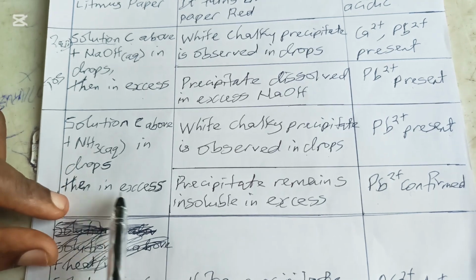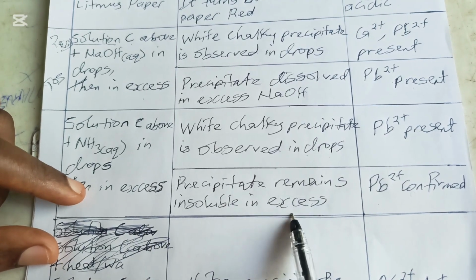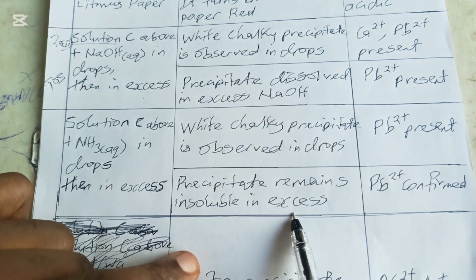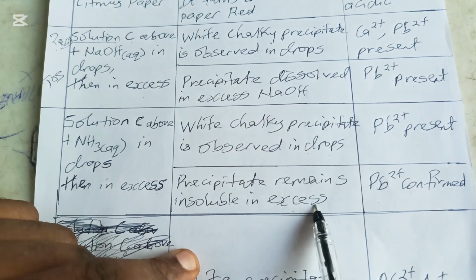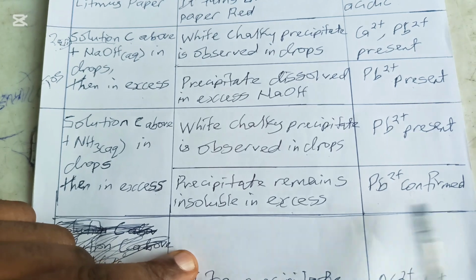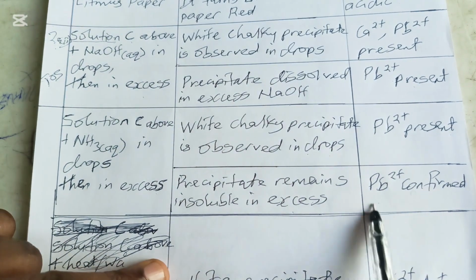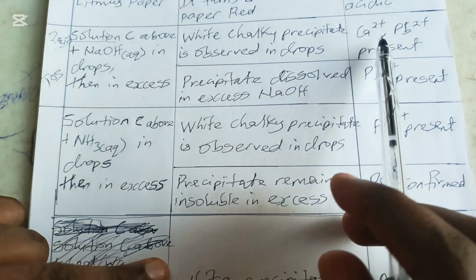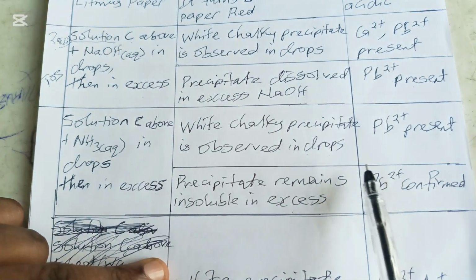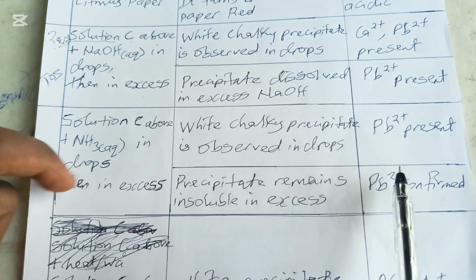Then in excess, the precipitate remains insoluble in excess. Very, very important. Precipitate remains insoluble in excess. Pb2+ confirmed, because when the precipitate remains insoluble in excess, this is the only one that can do that out of the two that were inferred. Mind you, you can only confirm if you have suspected up here, please.